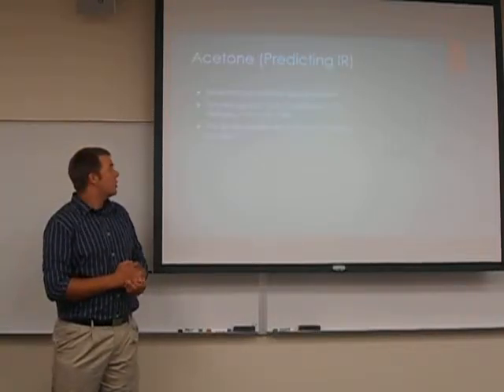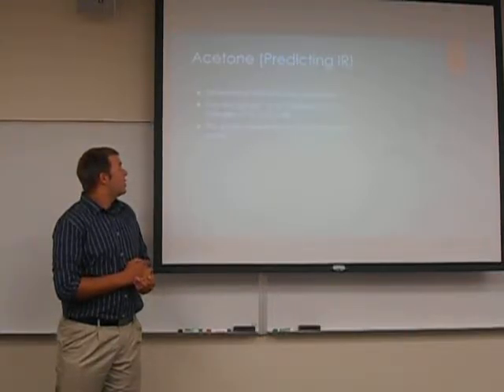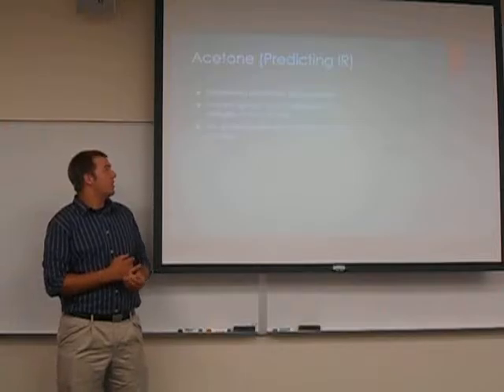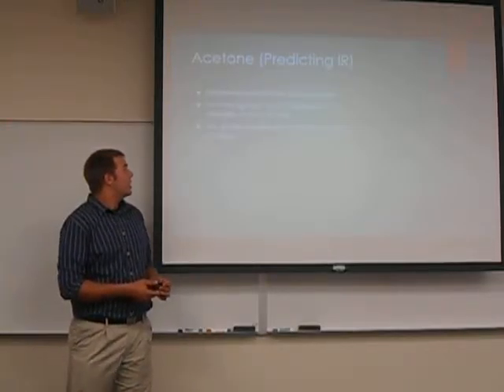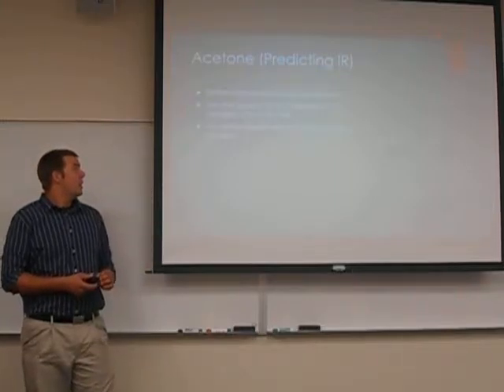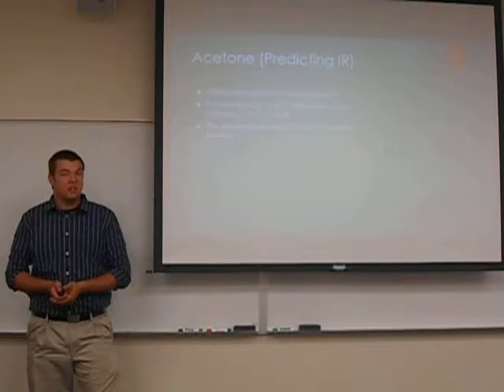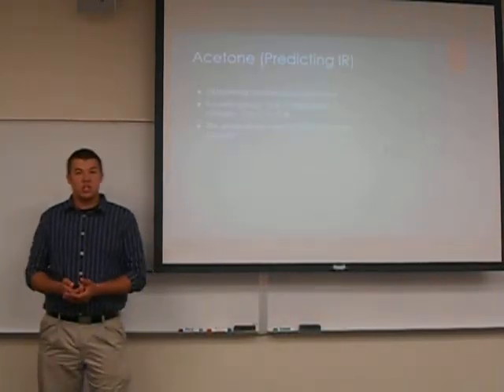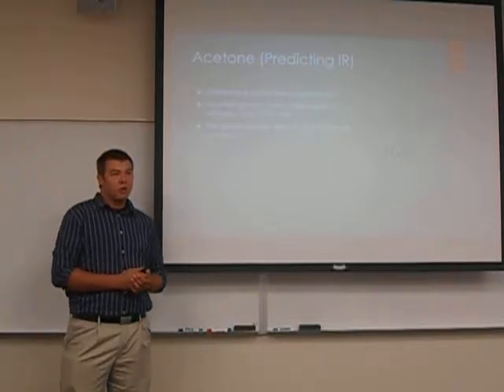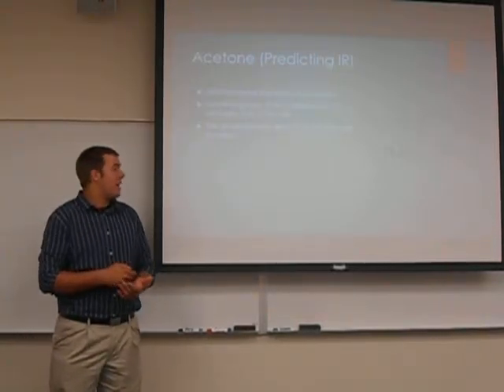We're going to determine all the functional groups, which we see are the CO, which the functional groups that we're looking for are either C single bonded O, CH benzene ring, CH single bonded C double bonded O, C to Cl, or C to Br. And the groups present in this one, as we can see, are the C double bonded to O and the C single bonded to H. So those are the two that we're going to look for when we look at the IR spectrum, when we actually look at the graph of it.